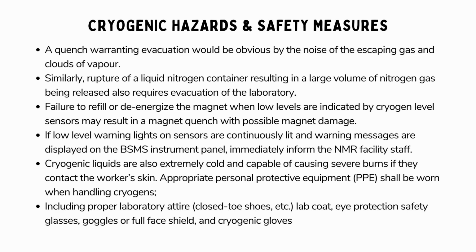Cryogenic liquids are extremely cold and can cause severe burns if they come into contact with the worker's skin. Adequate personal protective equipment, PPE, must be worn when handling cryogens, including closed-toe shoes, a lab coat, eye protection, safety glasses, goggles, or a full-face shield, and cryogenic gloves.